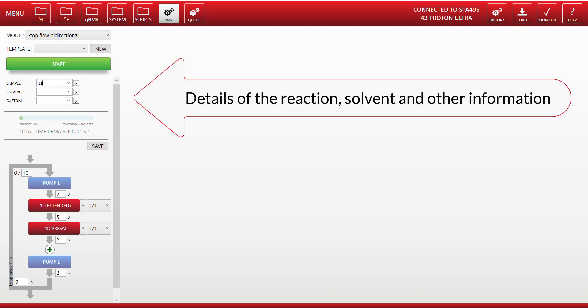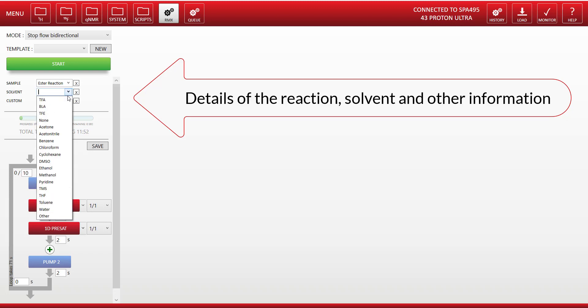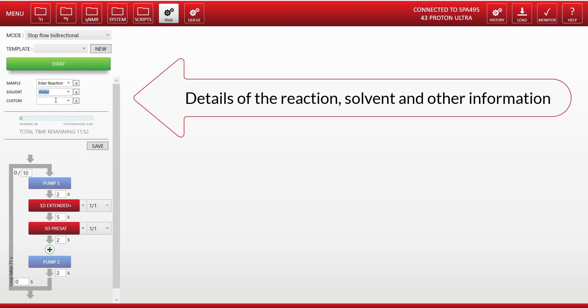In this area here you can recall details about the particular reaction you're running, the solvent you're running the reaction in, and any other custom information you want to record.